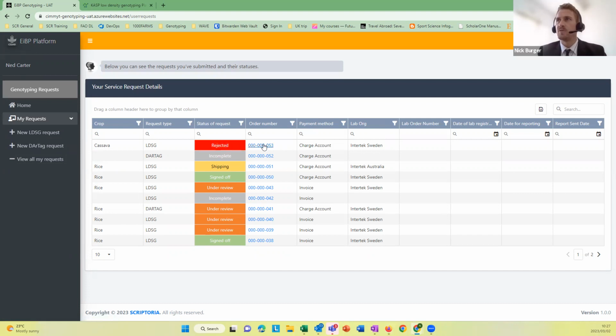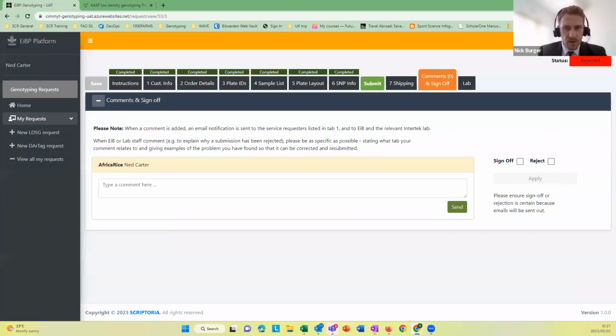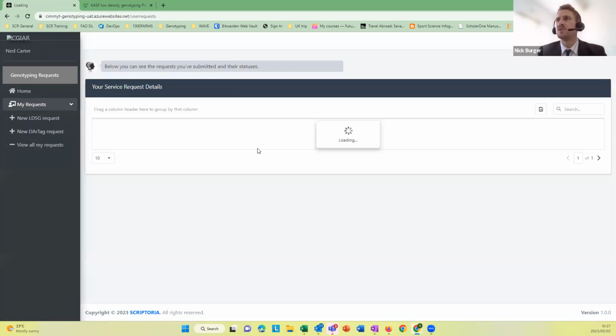If you want to return to this request, the link to access the details and information is under this column here, order number. You can see that is hyperlinked. If I open that up, oh, I forgot to send the comment, apologies. Let me go back to this step here and refresh.